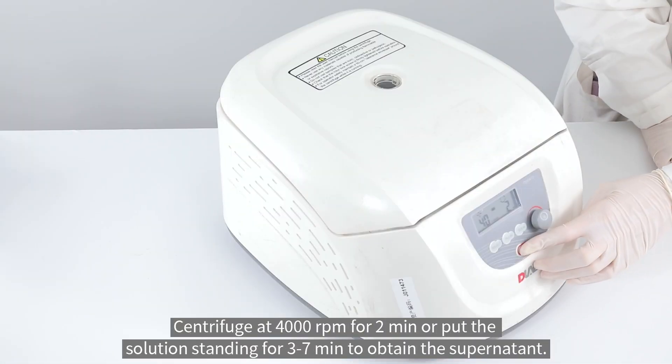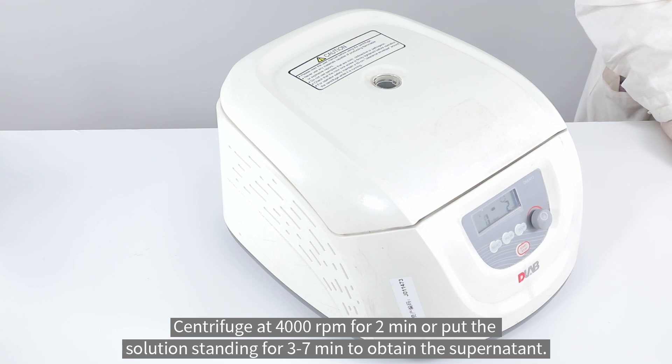Centrifuge at 4,000 revolutions per minute for two minutes, or let the solution stand for three to seven minutes to obtain the supernatant.